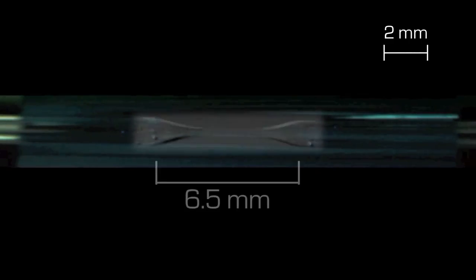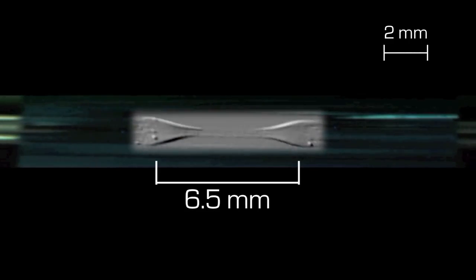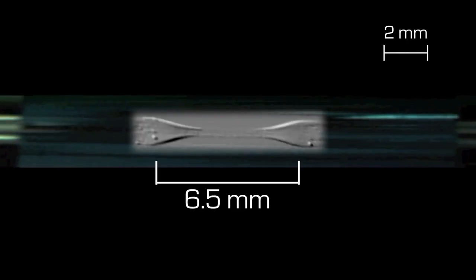Note how the narrow section of the hourglass has already darkened and hardened while material is being pulled from the shoulders which are still brightly lit. The final hourglass of the first pull measures 6.5mm shoulder to shoulder.